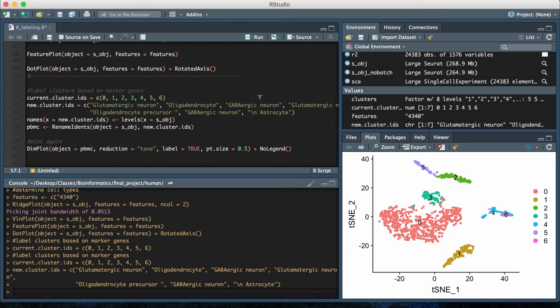In my particular case, I have seven cell type IDs labeled here, and the zero is going to be replaced in this case by glutamatergic neuron. The one label is going to be replaced by oligodendrocyte, two is going to be replaced by GABAergic neuron, and so on.